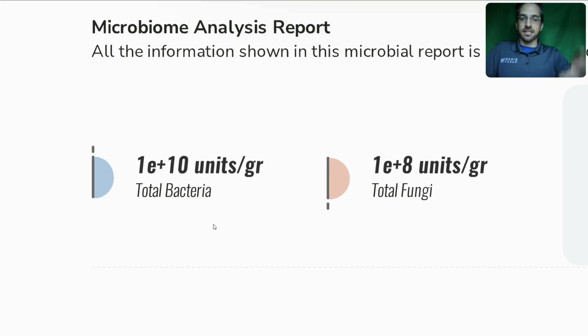And then lastly, to the right, bottom right of this page, you'll also see fungal to bacterial ratio. Bear in mind, this is a ratio of the marker genes of the organisms. If you've heard about fungal to bacterial ratio before, that's usually a measure of biomass, of bulk. So be aware, fungi tend to have a lot more bulk in their cells. They're bigger cells on average. And so they'll have less DNA than the bacteria will in the sample.